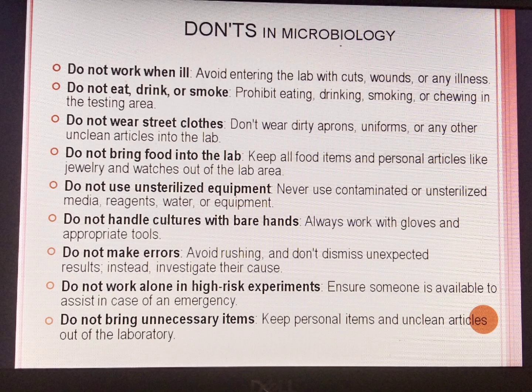Do not use unsterilized equipment. Never use contaminated or unsterilized media, reagents, water, or equipment. Do not handle cultures with bare hands. Always work with gloves and appropriate tools.